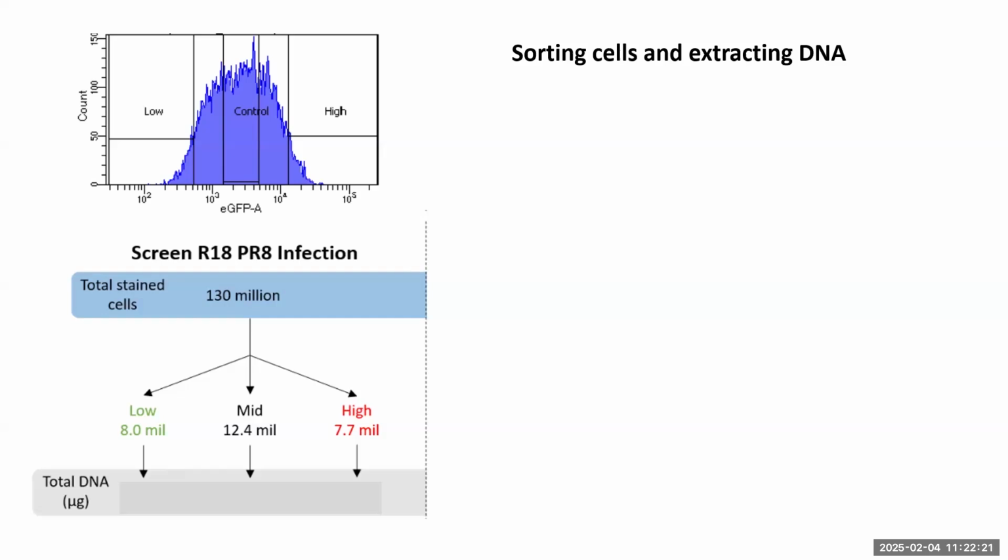What we found was key for some of the cell types that really aggregated was doing the experiments with the cells at low density so that they hadn't formed really tight junctions. That way you could lift the cells off relatively easily, put them through filters and get them into single cell cultures. That was a critical optimization step.